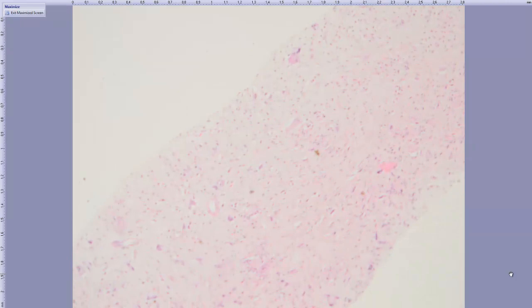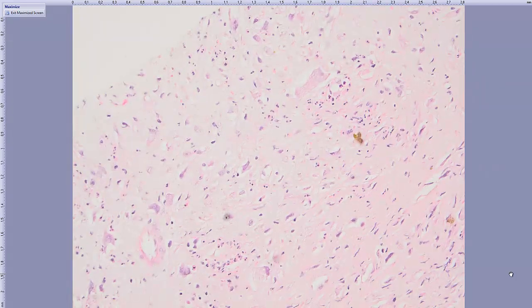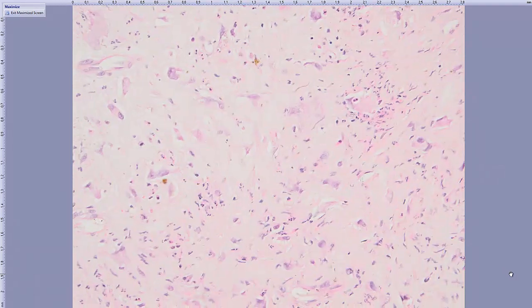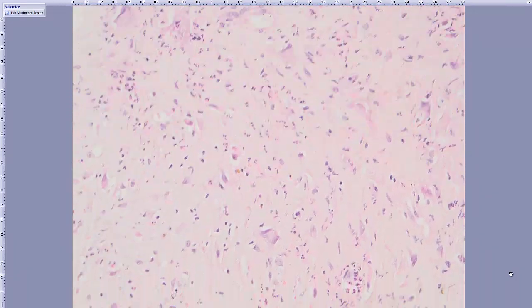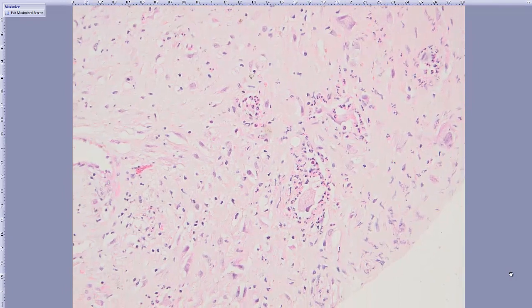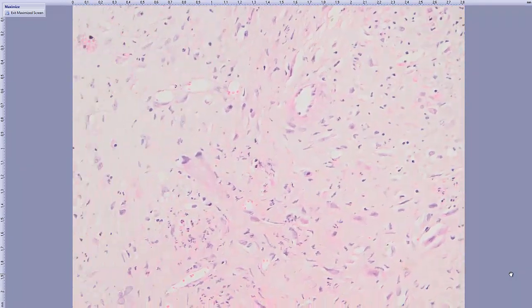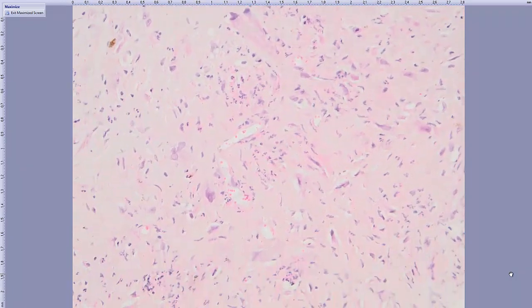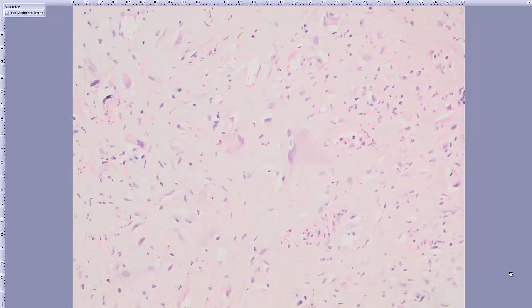When we come to higher power, we appreciate the inflammatory background and these cells are mostly neutrophils.